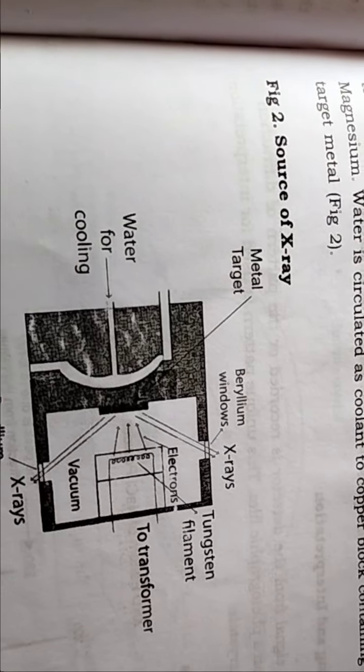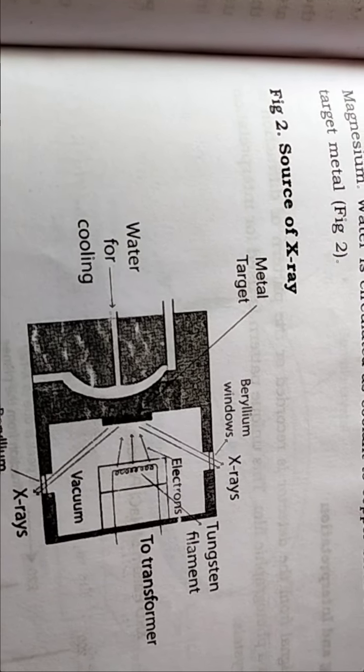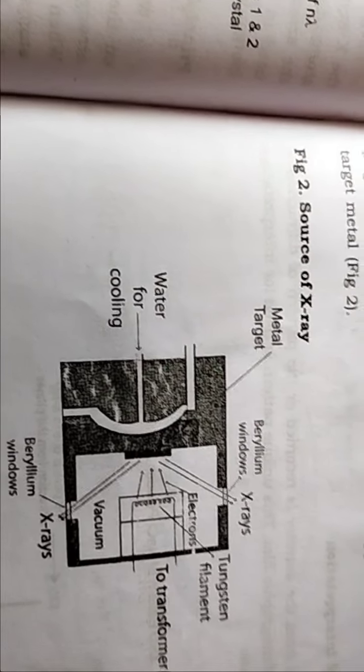The detector is used to capture the diffracted X-rays, which produce a signal that is recorded. The signals come from the diffracted X-rays, are detected by the detector, and are recorded by the recorder.